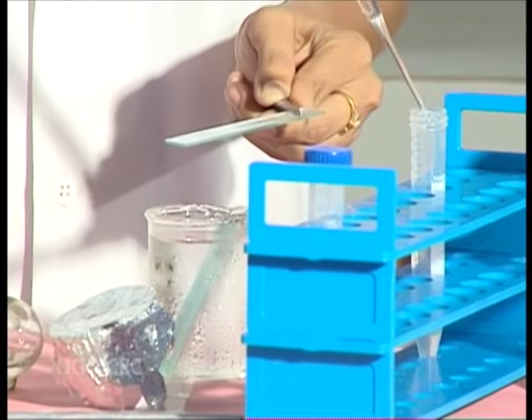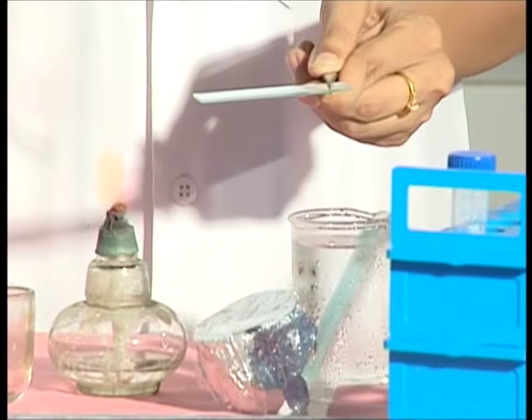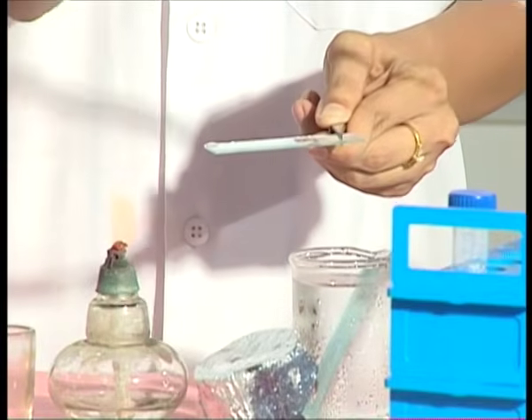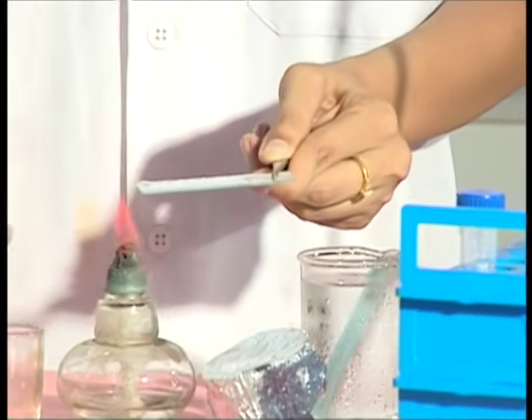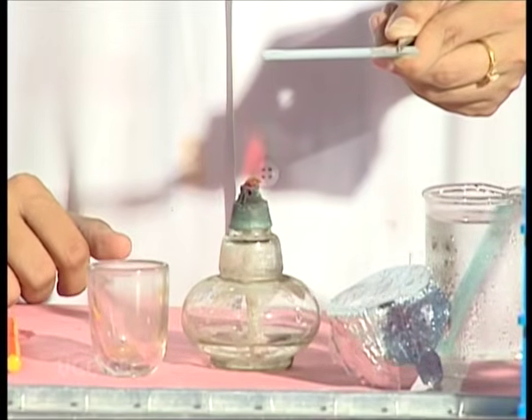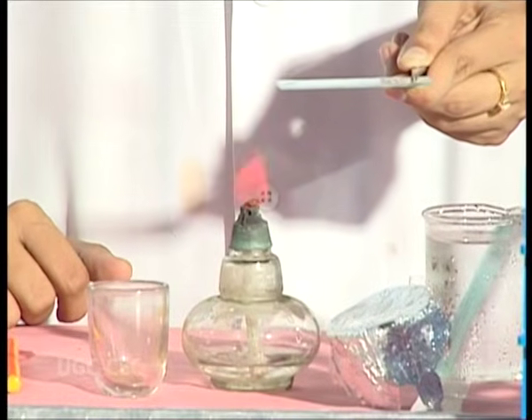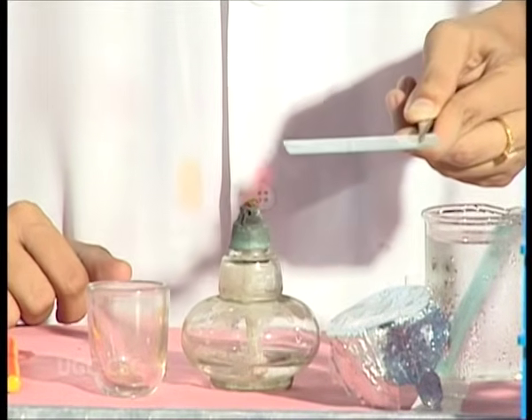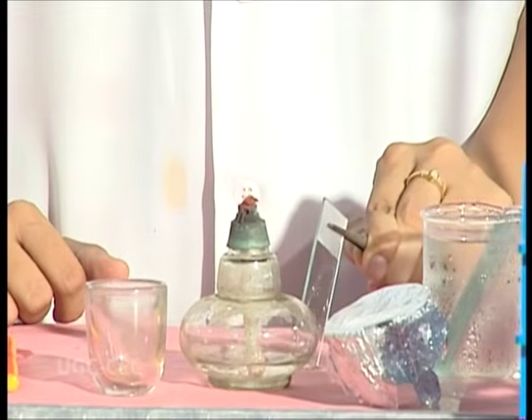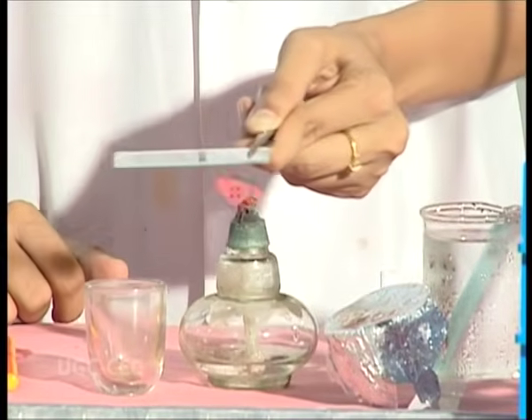For slide preparation, use a wet, clean, chilled slide. Take 3 to 4 drops of cell suspension on the slide and flame dry it. Drain the extra solution on the slide and label it appropriately.